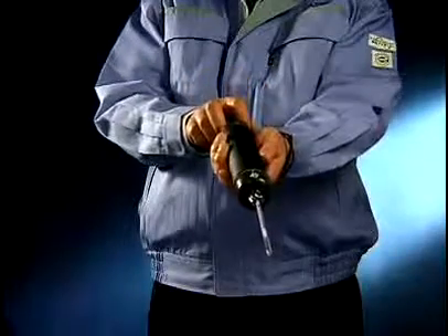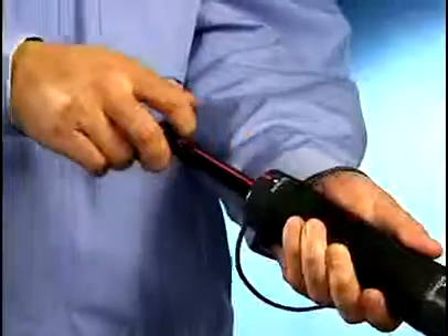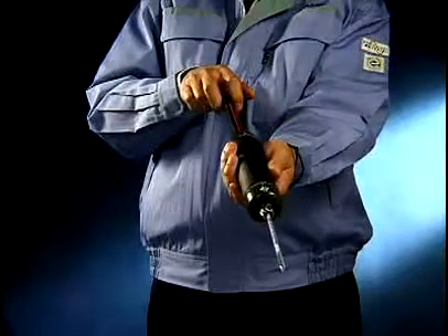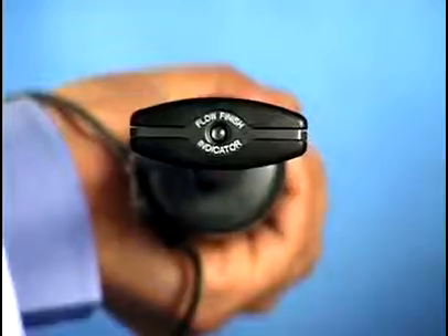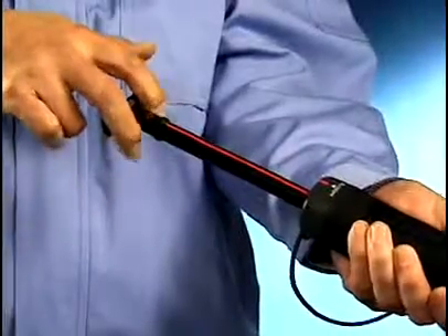Point the exposed tube end towards the point to be measured. Then fully pull back the handle in one motion. The stopper of the handle will lock with a click. Hold the tube still until sampling is complete. The completion of sampling can be confirmed by checking the finish indicator. Moreover, the handle cannot be moved.